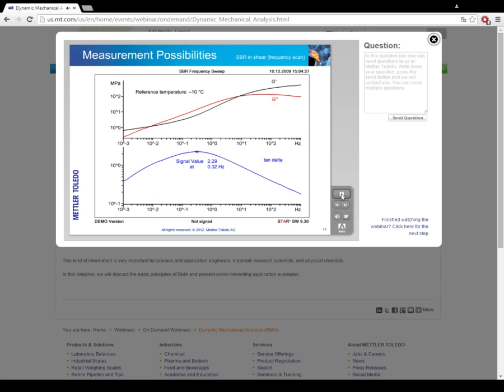In practice, materials undergo stress over a wide frequency range. Since the mechanical properties of materials change with frequency, information on the frequency dependence is extremely important. Depending on the application, a material usually has to exhibit different properties. For example, an adhesive should be able to absorb stresses due to temperature fluctuations, low frequencies, like a liquid.